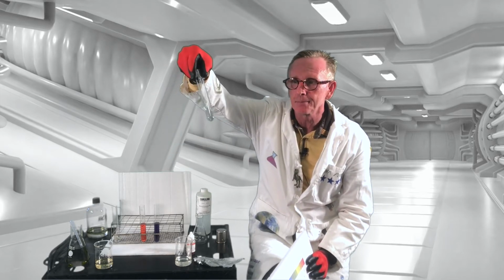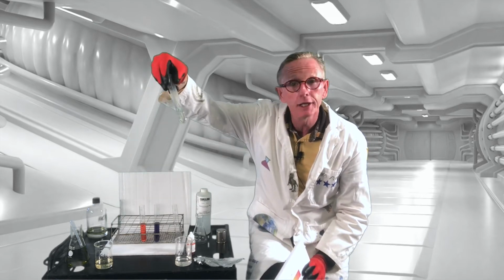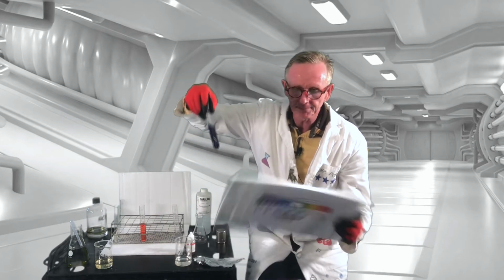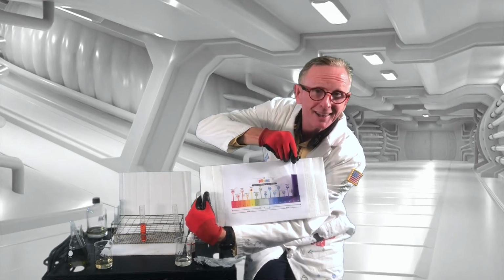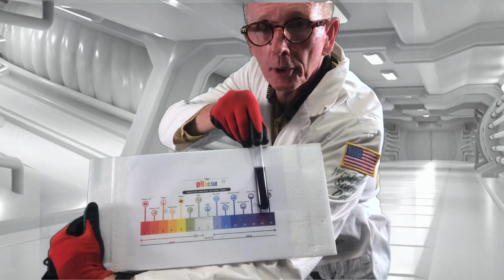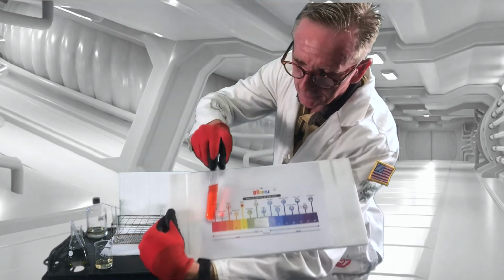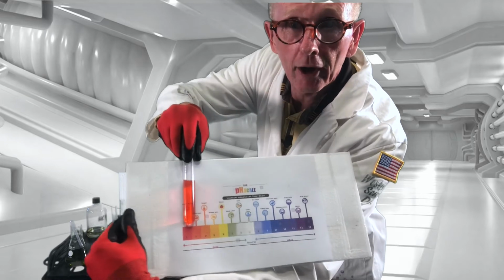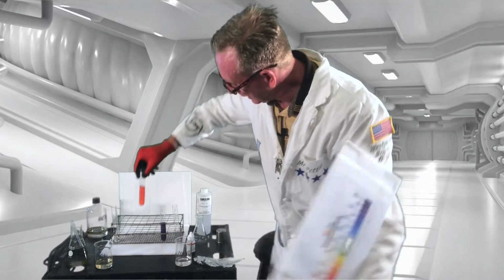And at this point, yep, the aluminum is completely gone. The sodium hydroxide is definitely way out here on this dark purple end. And obviously pretty far out here on this bright pink to red end.